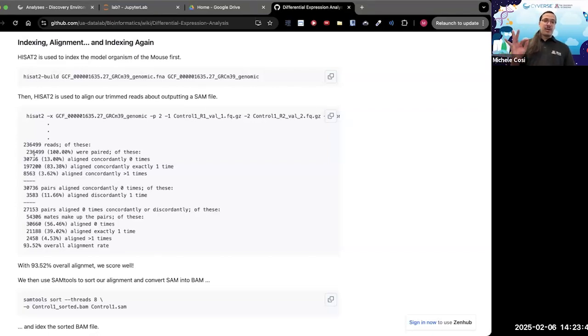But the total percentage of alignments is actually still almost the same. There was, I think, a 0.007% difference between the 3 tests that were run. So in the grand scheme of things, changing how many threads you use can lead to very minuscule changes.